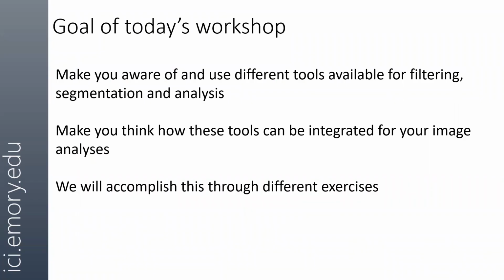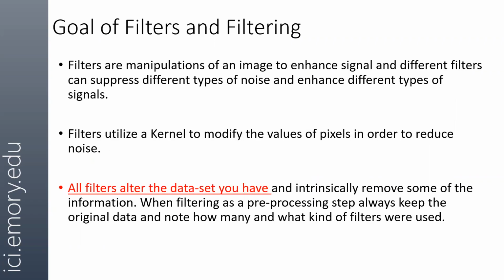Ideally, we can show you how to use these tools in a number of situations, not so that you're just following a set of instructions I give you up here, but so you can look at it with more informed eyes and then adapt your solutions to the problems you have. And we will do a number of exercises like yesterday, just to cement that kind of understanding.